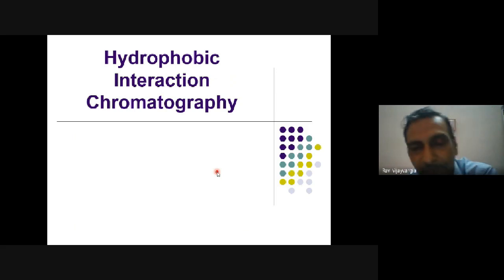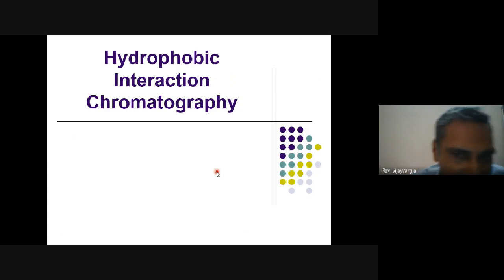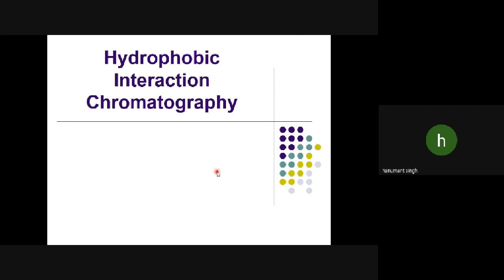All of you know that there are amino acids which are hydrophobic in nature. Can you name some of the hydrophobic amino acids? Excuse me, sir. Yes. Sir, in affinity chromatography, suppose we have the substrate, any substance, but we do not have any specific ligand for it. So in that case, how can we do that?